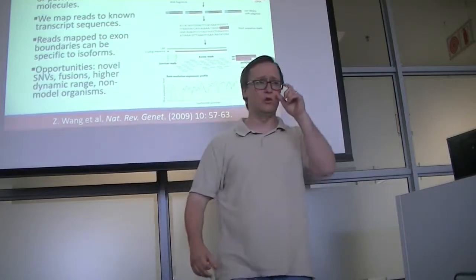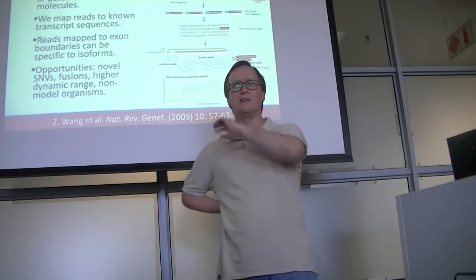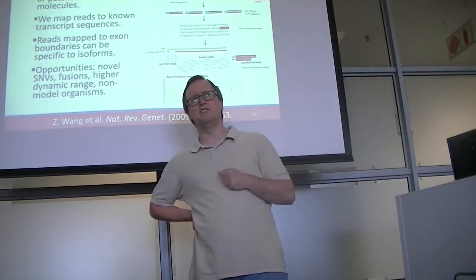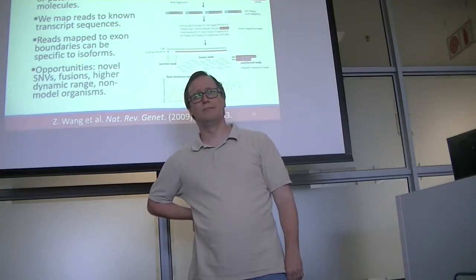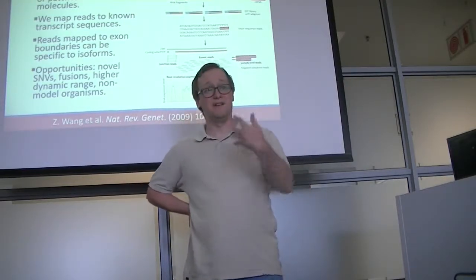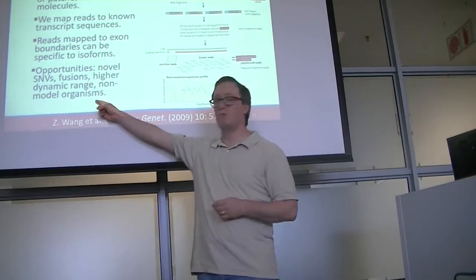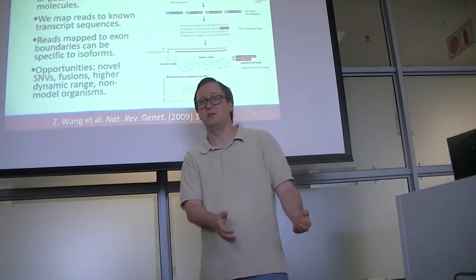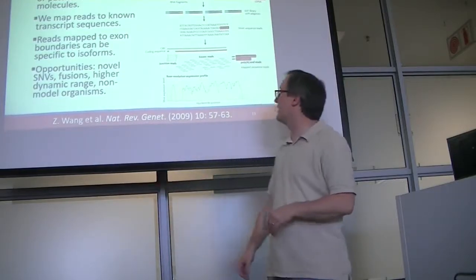And finally, non-model organisms. Now I talked an awful lot about buying microarrays for human samples when you're doing large-scale clinical testing, but if you're dealing with platypus, how many commercial products do you think there are for buying microarrays in platypus? All right, extra credit if somebody ever finds one for me. But yeah, I think you're right. I'm not aware of anyone making microarrays for measuring gene expression in platypus. So if your non-model organism is the platypus, if that's what you actually care about, you're probably stuck with sequencing because you don't have an alternative to it. So you can do discovery in non-model organisms by this.